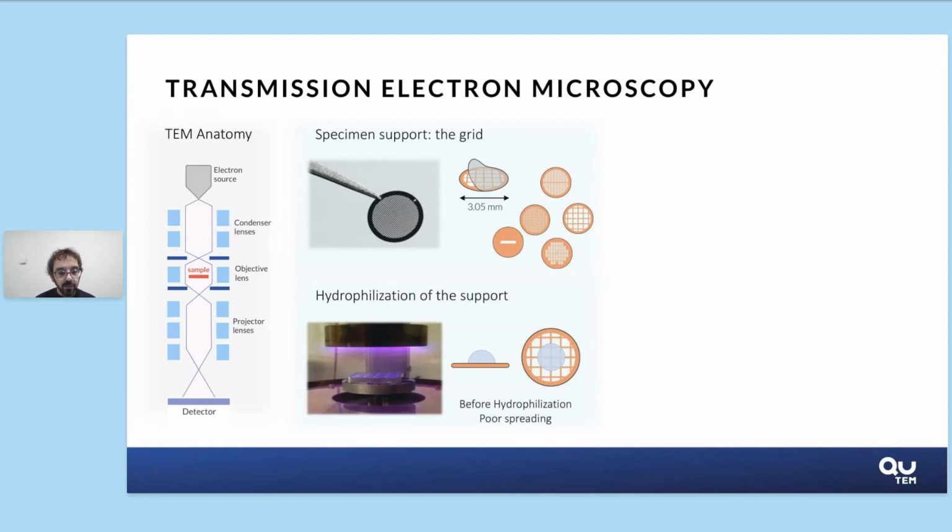So what we do is we place the grids, prior to sample deposition, into a small chamber in which we have 2 electrodes, and then we apply a current under low pressure conditions, so that the gas which is present in the chamber will glow and will be ionized. And then charges will deposit all over the chamber, and amongst others, they will deposit onto the grid as well.